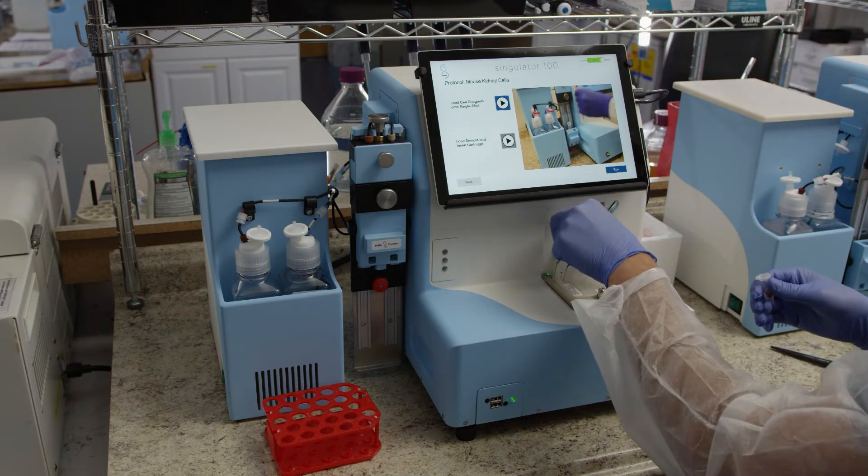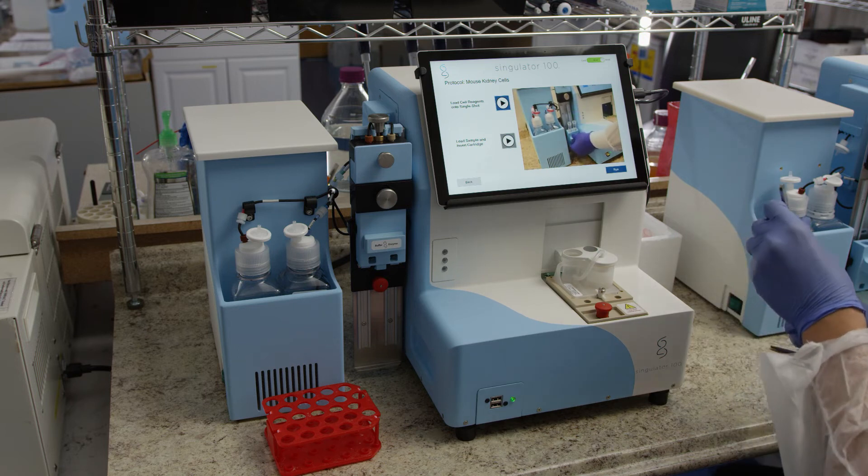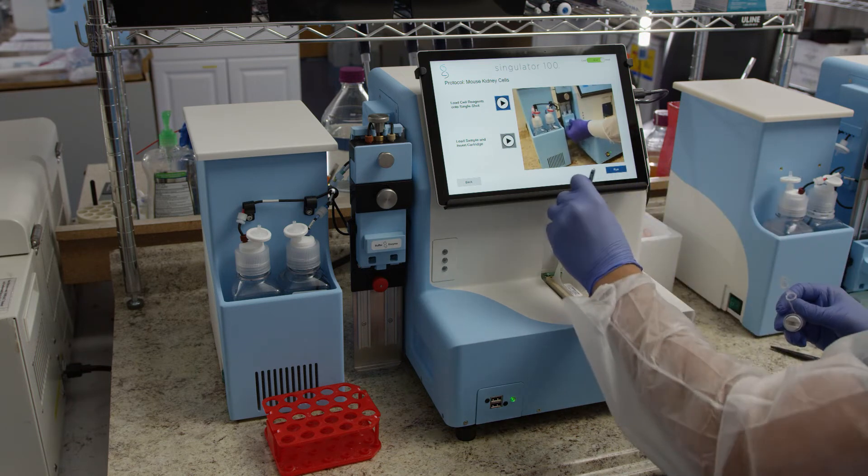Remove the sample disruption cap from the cartridge. Place the sample at the bottom of the disruption chamber and replace the disruption cap.